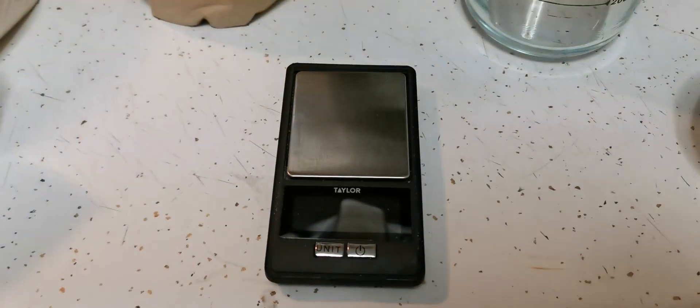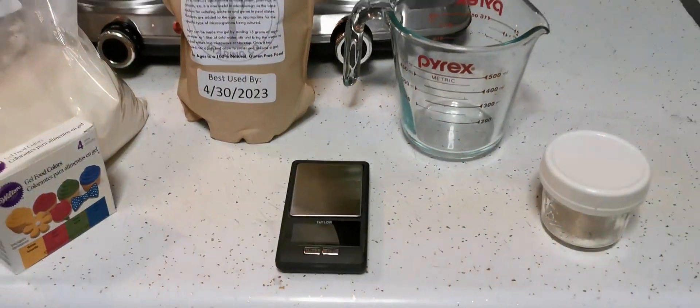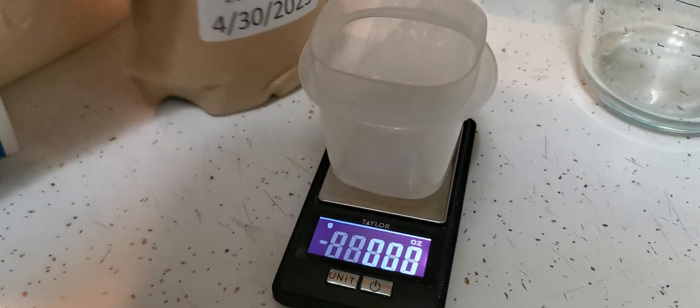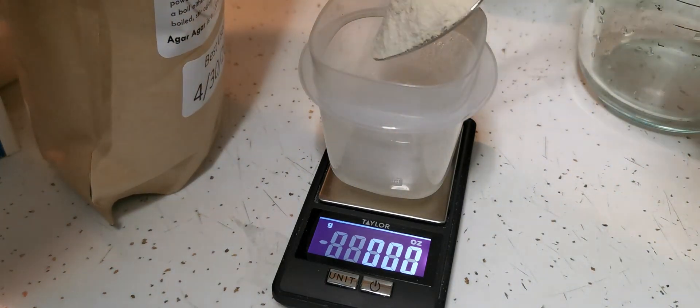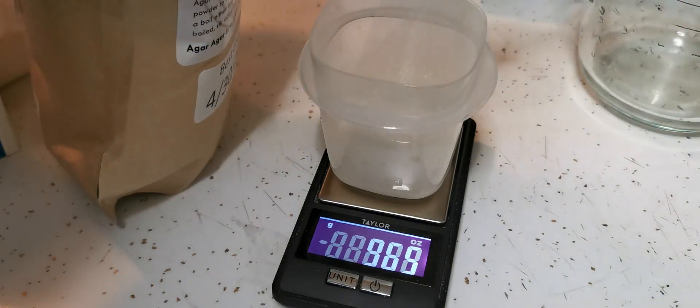I'm going to use a digital scale to measure our ingredients. For 500 milliliters of water, we're going to use 10 grams of the agar powder and 10 grams of the light malt extract.